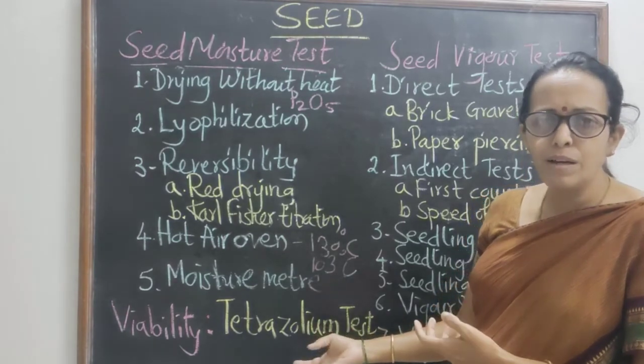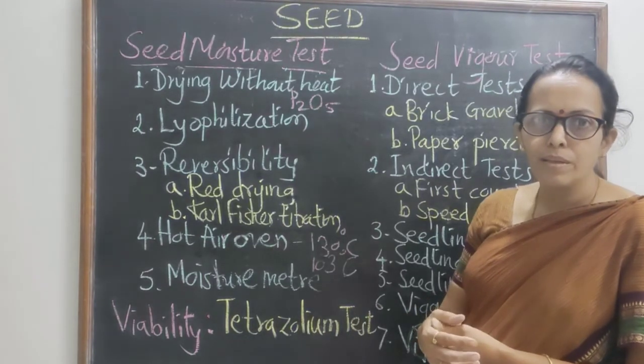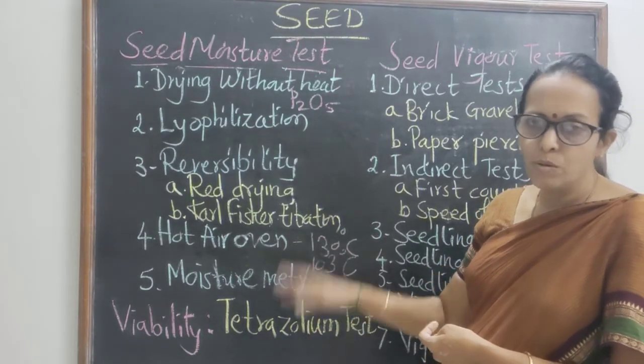So it is a very quick method, where tetrazolium is used to test the viability of the seeds.